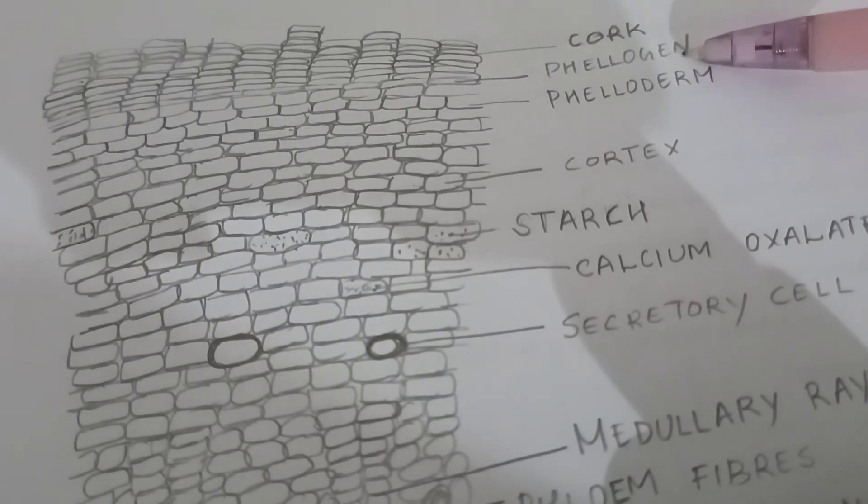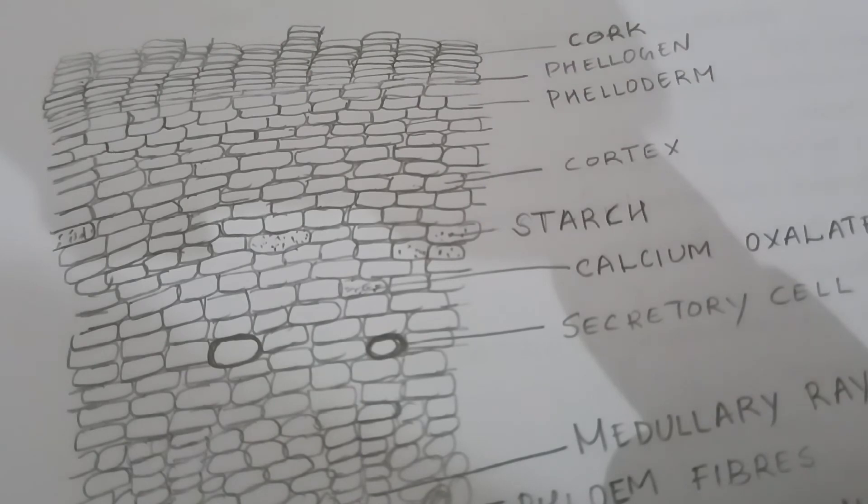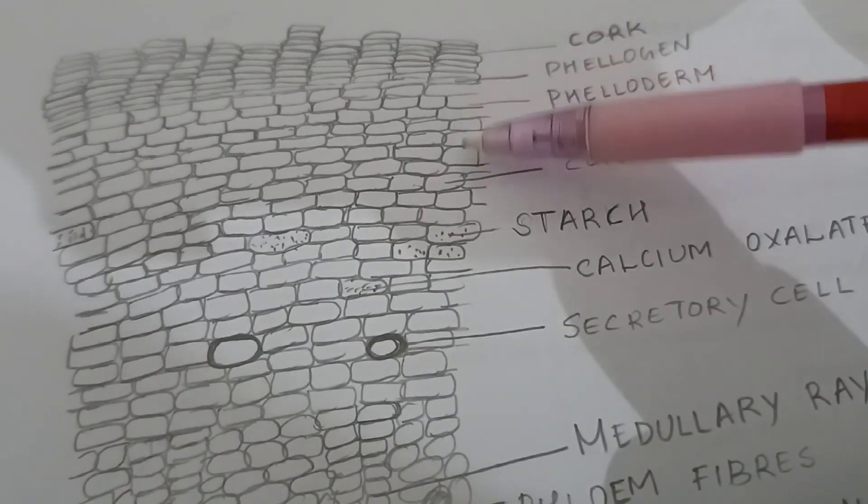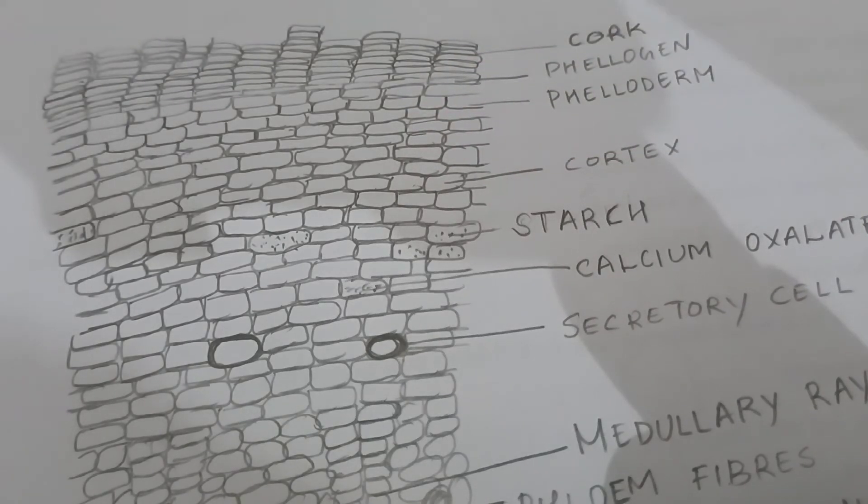Below that there are 6-8 layers of thin-walled rectangular cells without any cellular content. They are like cork, arranged at times in radial rows. These cork, phelogen, and pheloderm are all part of periderm.